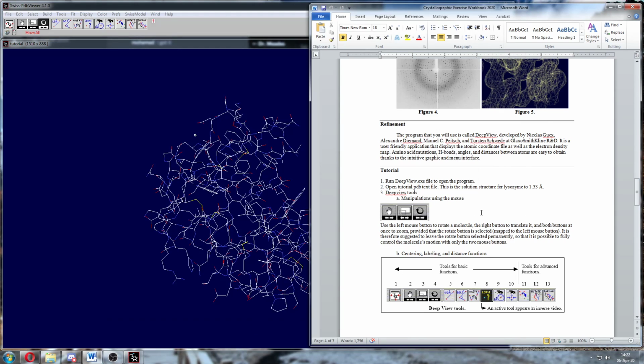Okay, so on the program itself, you notice there's these 3 buttons. It's a little hand button, a pair of windows, and then this little round rotational thing, arrow thing. All right, we're going to learn what those 3 things do. And they're your basic utility tools.